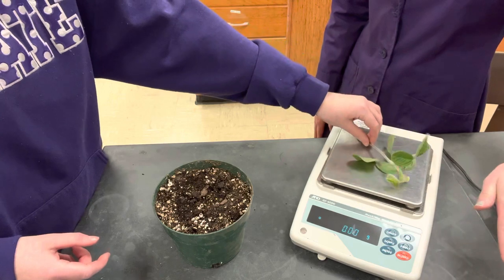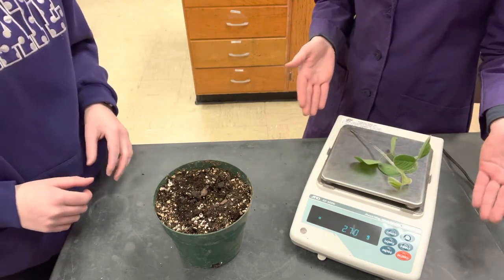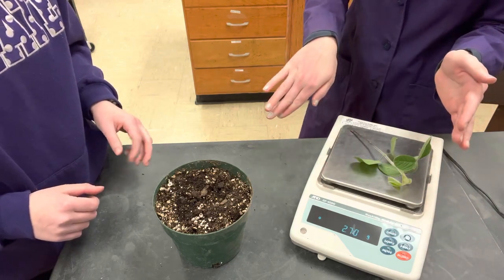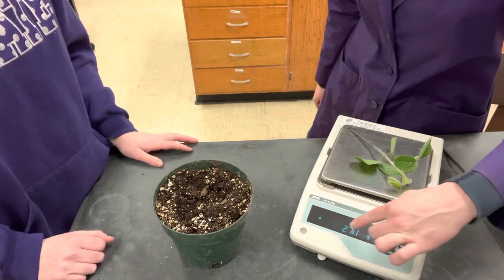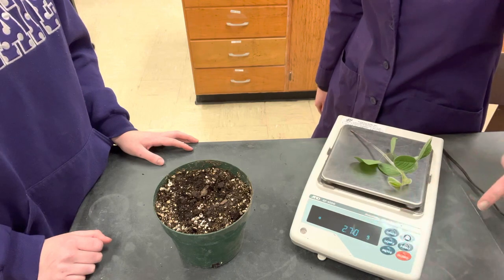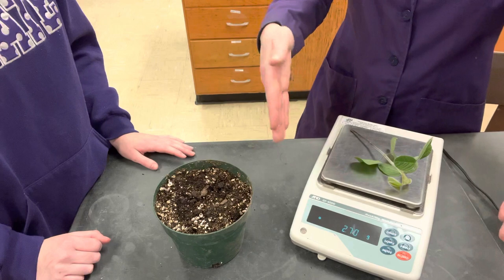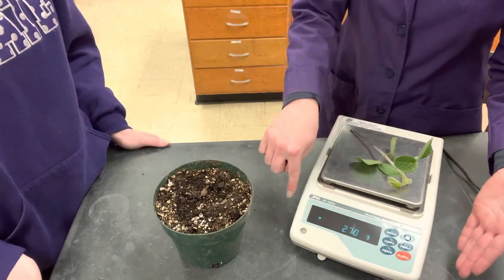You can place it on the scale. Ours fits completely on the scale, but if yours is larger you might need a container to set it on. Just make sure that you tare out the weight of the container before you place your soybean on the scale. Ours is reading at 2 grams, 0.7 or 0.69. At this point you would want to go ahead and take a picture of this with the soybean on the scale and what the weight measurement is.